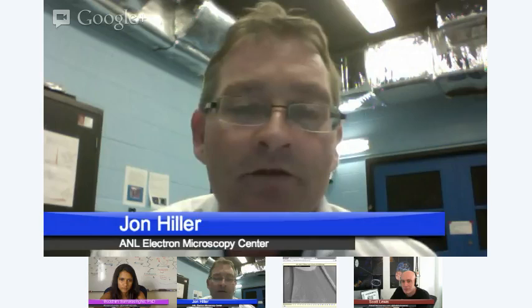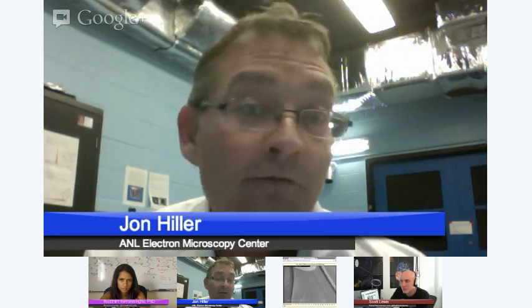And so the idea that I wanted to show you is, I didn't have a video of what I wanted to explain. Let me get back into here. Now you have this very sharp probe tip that can interact with the sample and move it. But let's say we use the ion beam. We have this very small particle of interest. You can't even see it with your human eye. You need an electron microscope to see it. And we want to move it for the next level of microscopy, which is transmission electron microscopy.